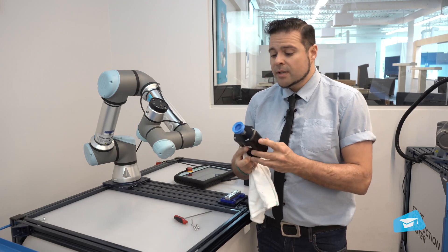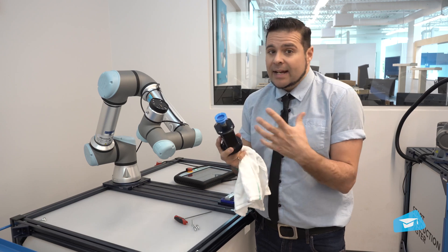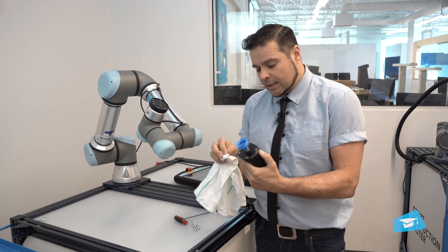For inspection, you want to look for any damage, any sign that the gripper might have hit something. So you want to visually inspect the unit carefully.